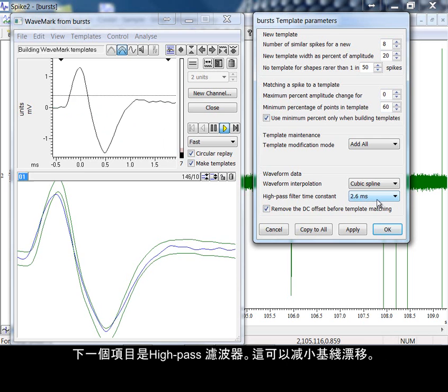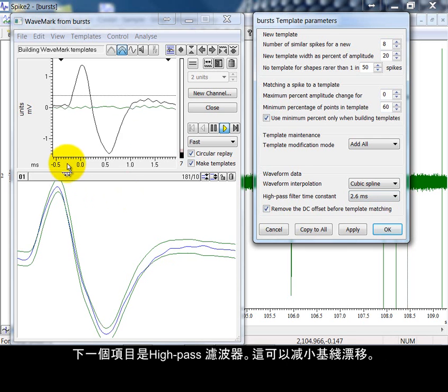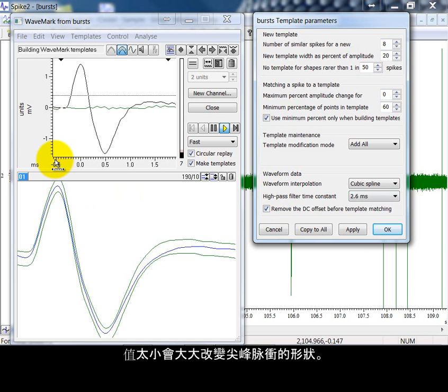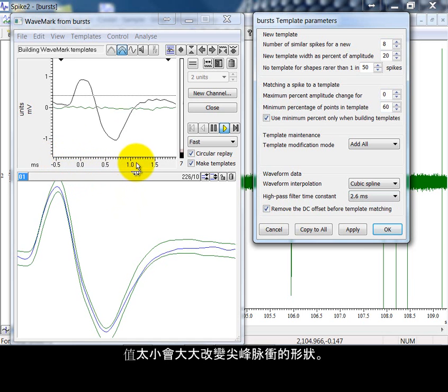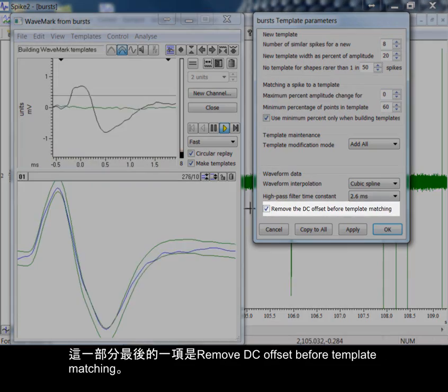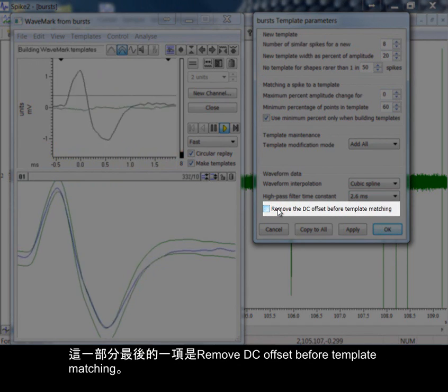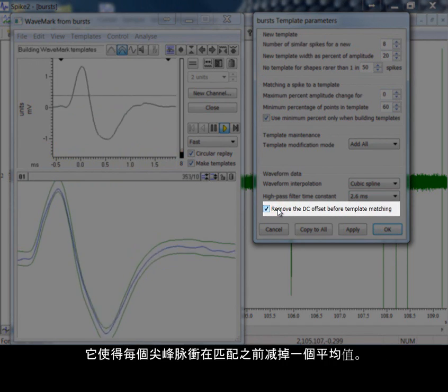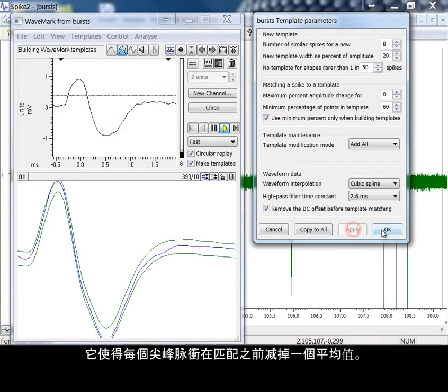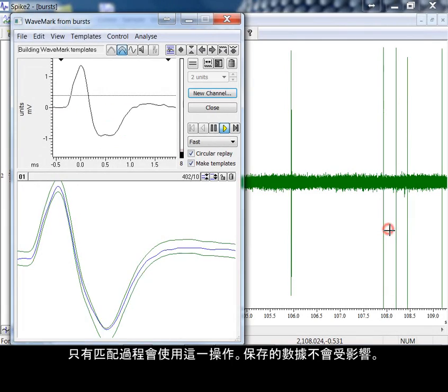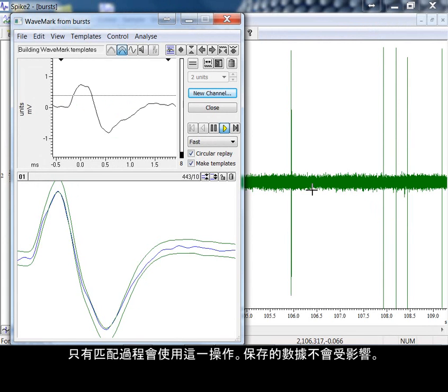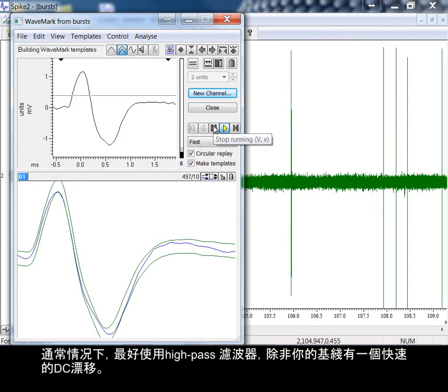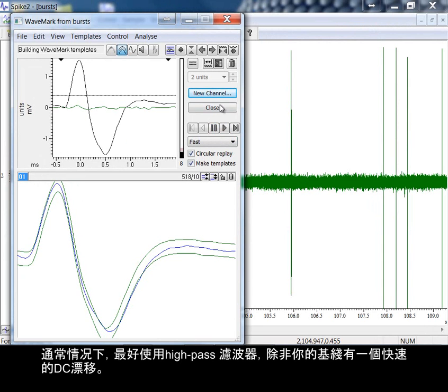The next item is a high pass filter. This reduces baseline drift. As a rule of thumb, it should be set to approximately the width of the oscilloscope display. Too low a value will significantly change the spike shapes. The last item in this section is remove DC offset before template matching. This subtracts the mean level from each spike before matching. Only the matching process uses this operation; the saved data is unaffected. It is usually better to use the high pass filter unless you have a sudden DC drift in your baseline.